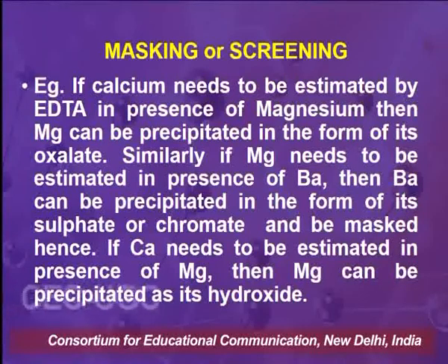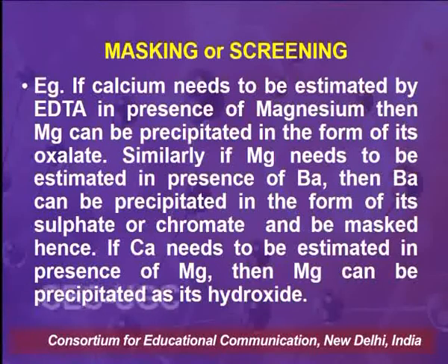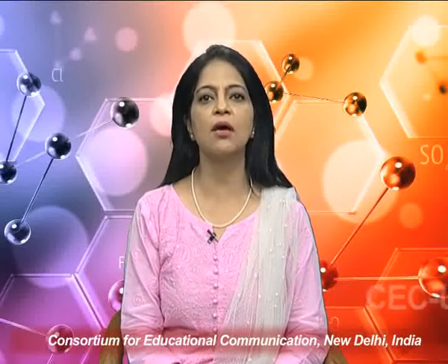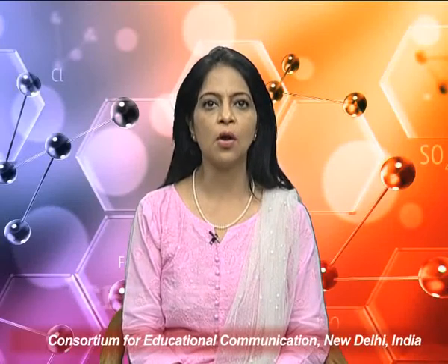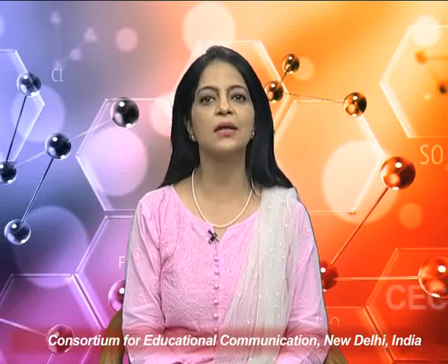If calcium needs to be estimated in the presence of magnesium, as in the case of hardness determination, then magnesium can be precipitated as its hydroxide, which won't interfere in the titration of calcium with EDTA, using eriochrome black T as the indicator. Another method for masking or screening of metal ions so that they do not interfere in the titration of another metal ion in its presence is oxidation and reduction.